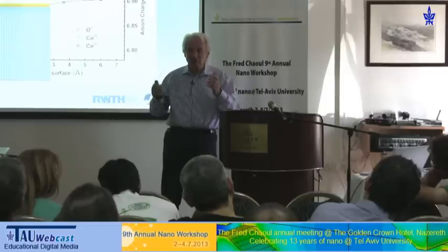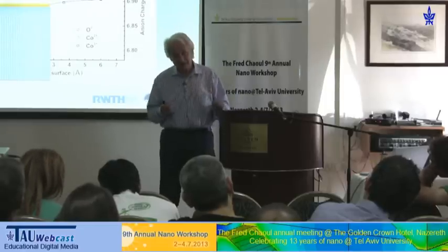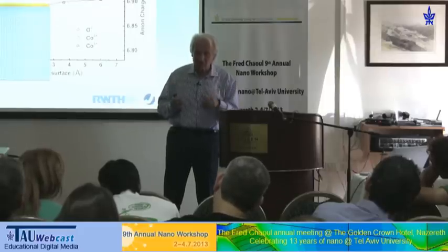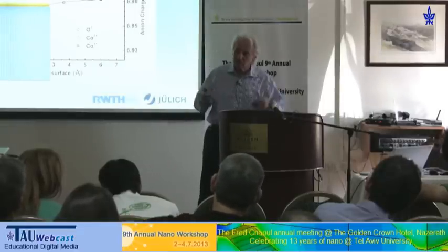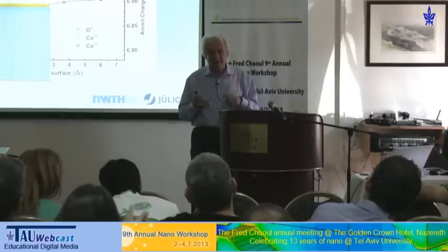That means when you go to smaller and smaller dimensions, the dose you have to apply increases. So far, the situation is this, that the resolution for biological materials is limited, say, to a few angstrom or nanometers.